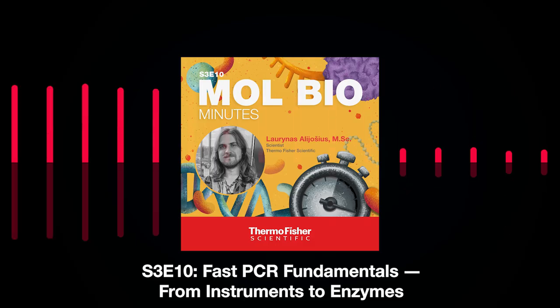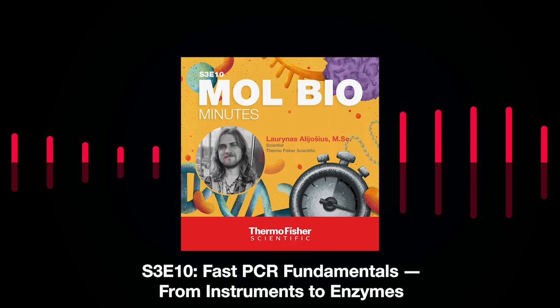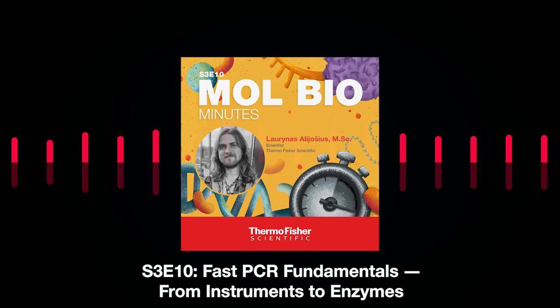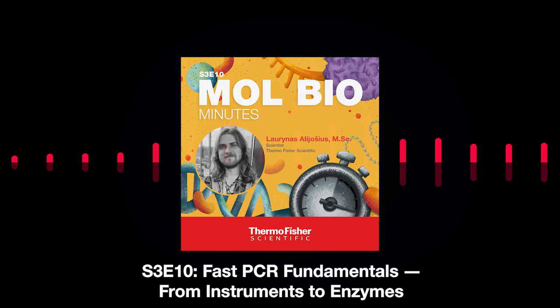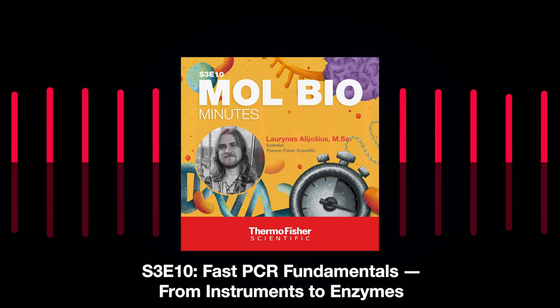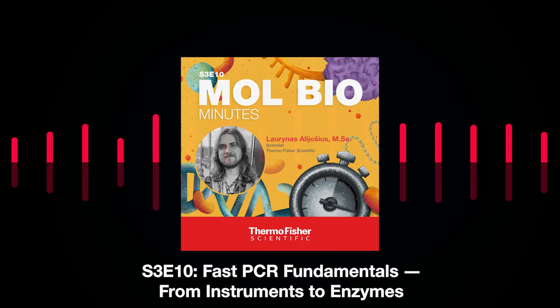And that's real good. For example, if you are using PCR to later sequence those samples for sequencing purposes when you need precise original sequences amplified, or if you're using thermostable polymerase, that means that this enzyme will last you long because it will be more stable, and in that case it will bring you a more consistent performance overall over time.